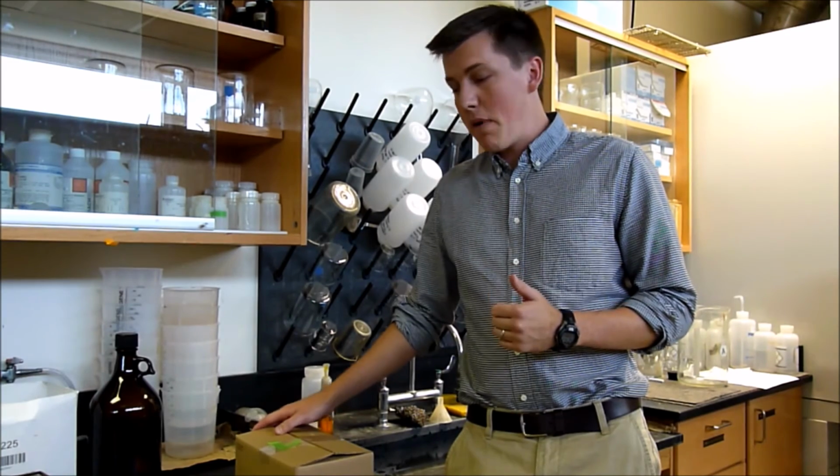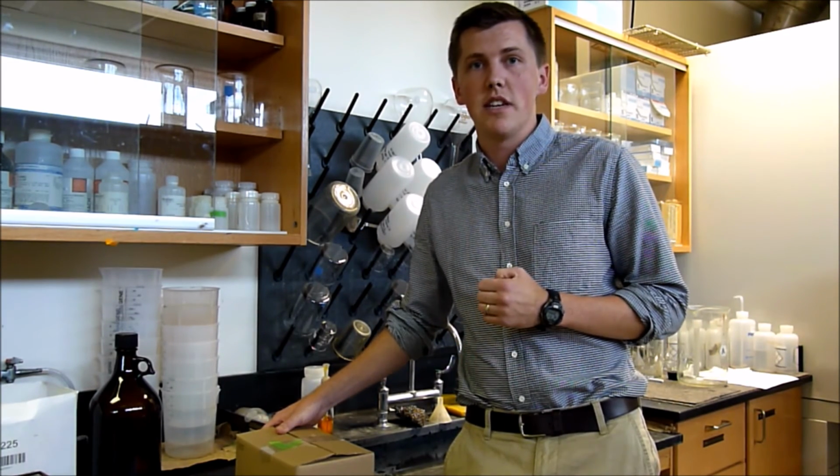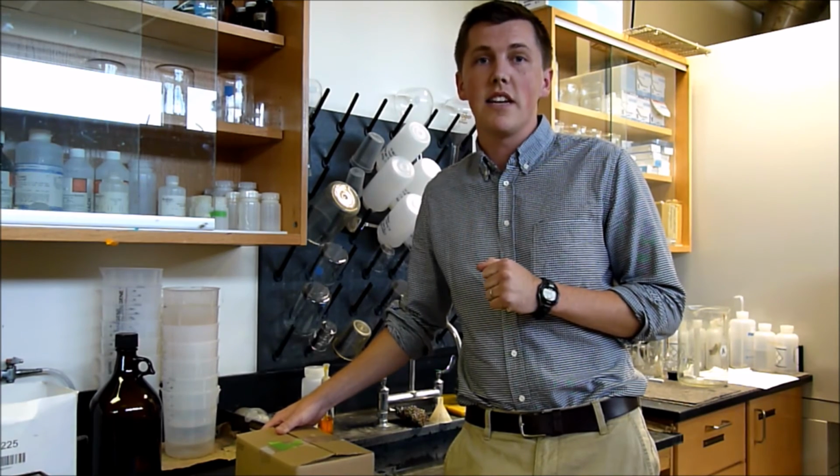Now that your box is repackaged, be sure to return it to the same location where you picked it up so it can be shipped back to Virginia Tech. If you have any questions at all about this process, Jeff Park's contact information is on the instruction sheet, and don't hesitate to call him.